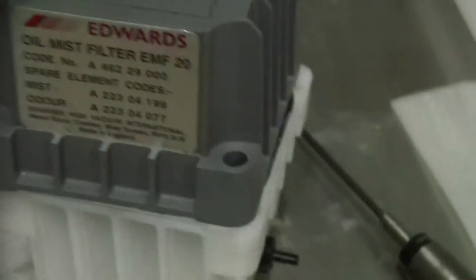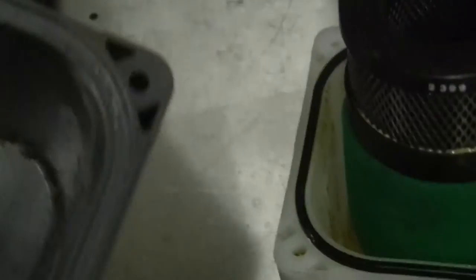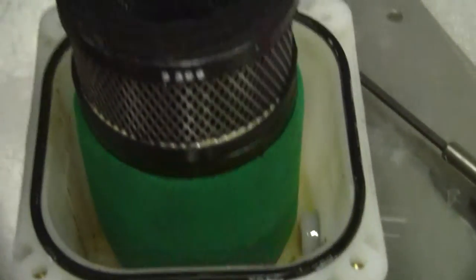This is a used piece, so I'm going to pop open the top. There we go. Take a look inside there — there's your filter cartridge.